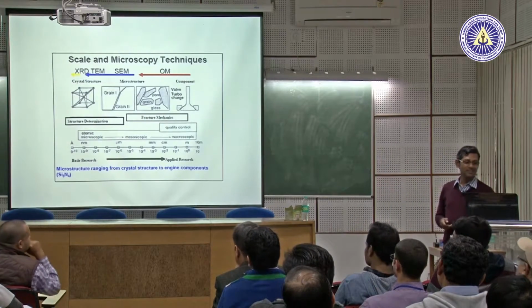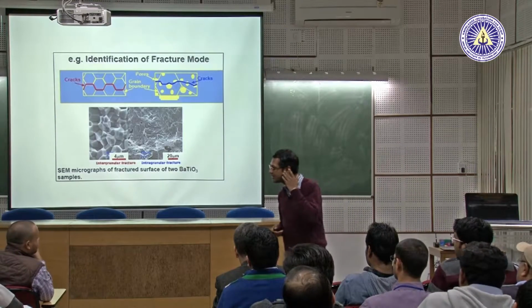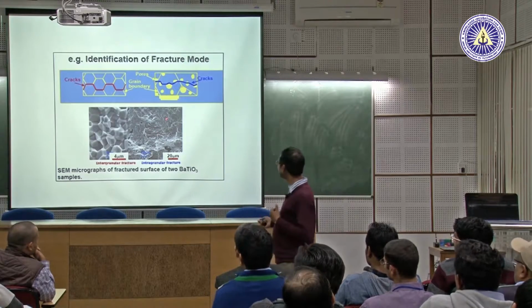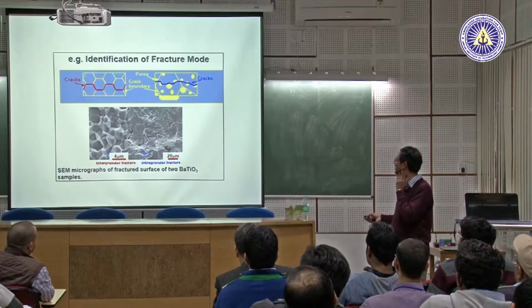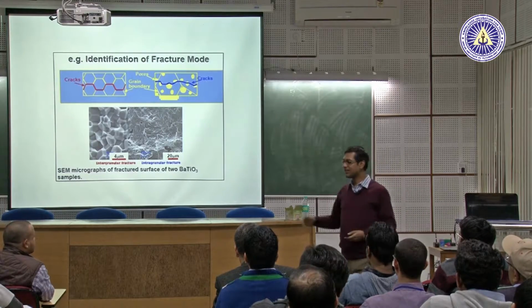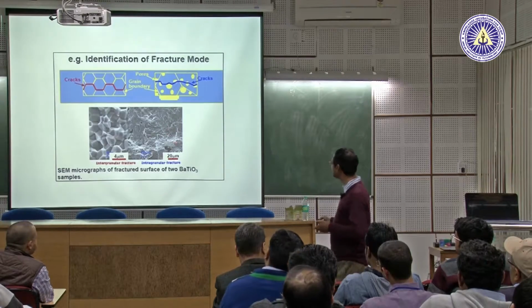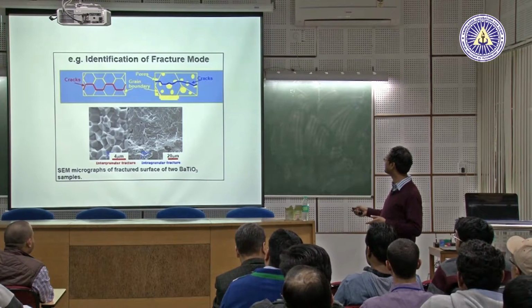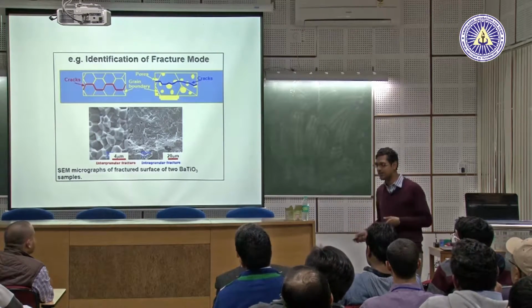Sir, shall we say it's melted? Pardon? Melt? No, this is not melted. You can see here, this is, I don't know, can I say something? I don't know, maybe Nilesh is better. You have seen river patterns or cleavage type fractures, okay? So this looks like that. There are pores, these are pores. You can see here, these are actually pores. And the crack has gone through one grain to other grain. Otherwise, it could have looked like this.